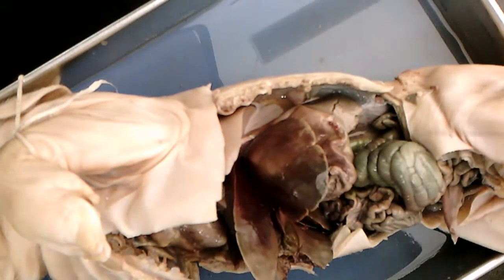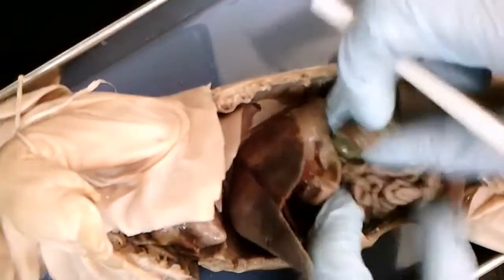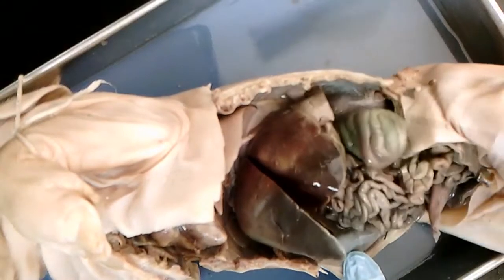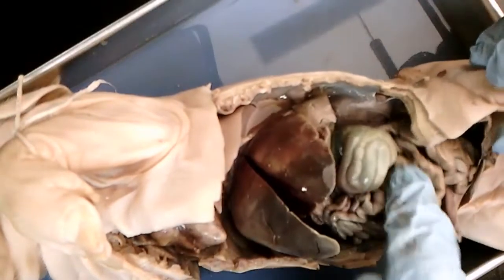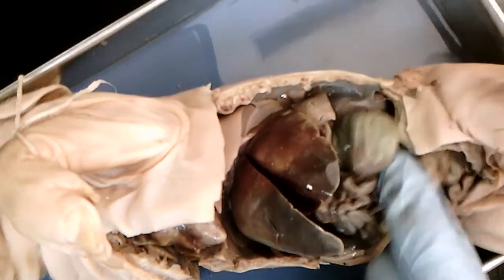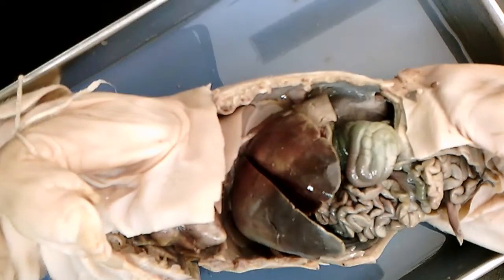Okay. So we did the spleen, we did the lungs and the heart and the liver and the gallbladder. Let's see. So then we have the intestines. So we have the small intestines and then the large intestines. At the junction of the small and large intestines is the cecum. So try to help your students identify the cecum. Your handout's going to tell you it's a bag-like structure equivalent to our appendix.